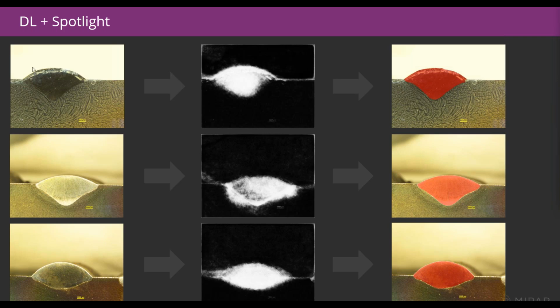So we've used Snap and its boundary recognition abilities to objectively select what the weld beads are and label areas of the other classes. That's produced these models, which then get fed back into the automated Spotlight tool to select the boundary edges now in an automated fashion, in an algorithm that can be applied automatically to other weld beads.